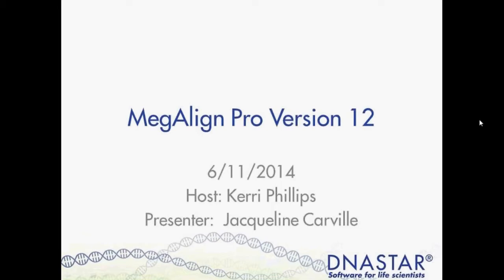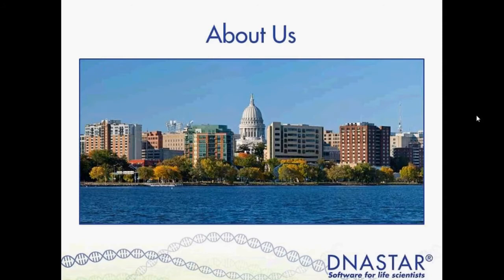Hi there, thanks Carrie. So to get started today, I'll be giving some background on DNASTAR as a company, as well as MegAlign Pro itself. And then I'll be getting into the software where I'll preview the new MegAlign Pro features that are coming soon in Lasergene 12. So as a little bit about us, we are a global software company headquartered here in Madison, Wisconsin. Our sales, marketing, developers, and support network are all located here. So if you have any questions or need support, we do have the full team available to answer you, and then relay your feedback to development to make our software even better in future releases.